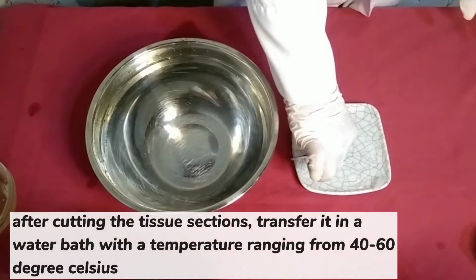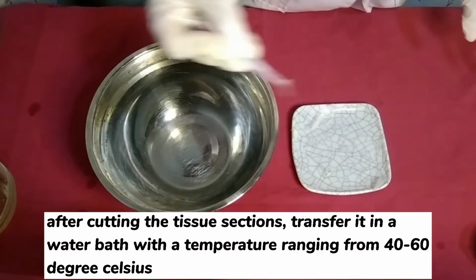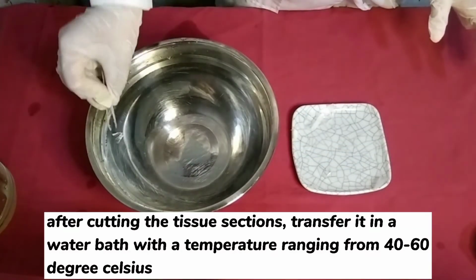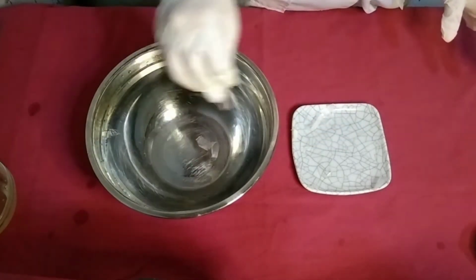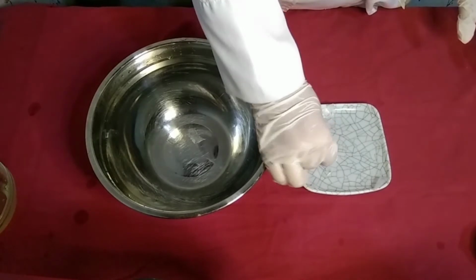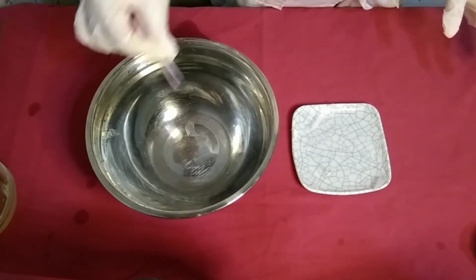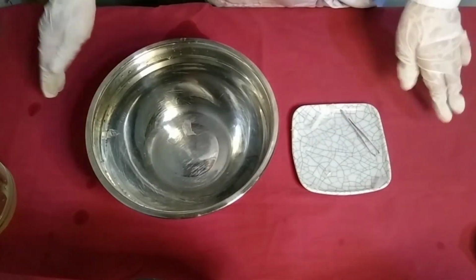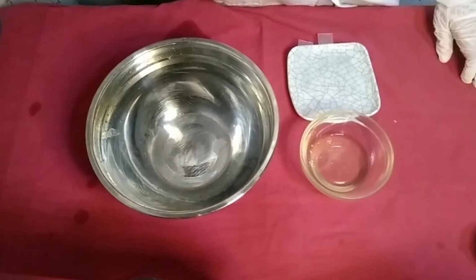After cutting the tissue sections, let's then transfer them to a water bath with a temperature ranging from 40 to 60 degrees Celsius. Putting the tissue sections in a water bath that exceeds this temperature can cause the tissue section to distort or wrinkle. So after a few minutes of letting the tissue sections float in the water bath, this technique will expand the sections to their original dimension and ensure they are completely flat.